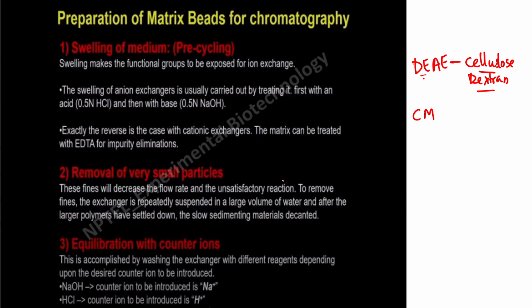Then you will resuspend the whole swollen beads in large volumes of water. Once you resuspend it in water, since these particles are heavier, they will settle down first, and whatever small particles, dirt is there in those beads, in that matrix, that will float, and at that time you can decant the water from the top and then again fill it with water. So do it 2-3 times so that all the dirt is removed out of the beads.